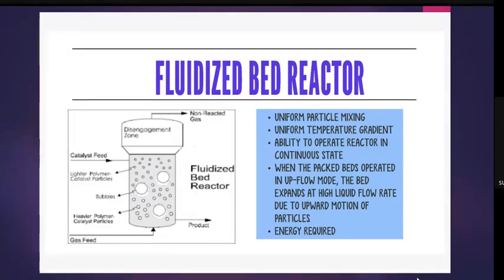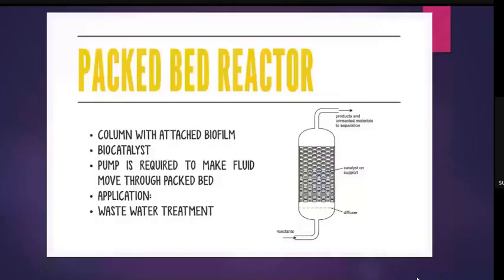And it is in contrast to the packed bed, where the polymer is loosely packed in the fluidized bed, whereas here it is tightly packed. All the polymers have been tightly packed and settled in a layer.